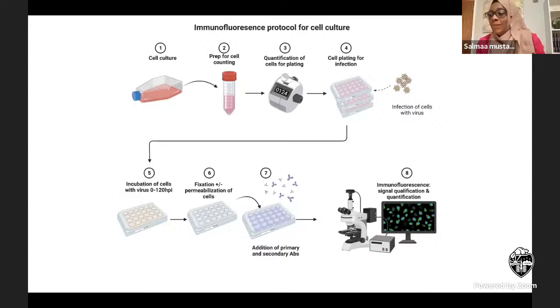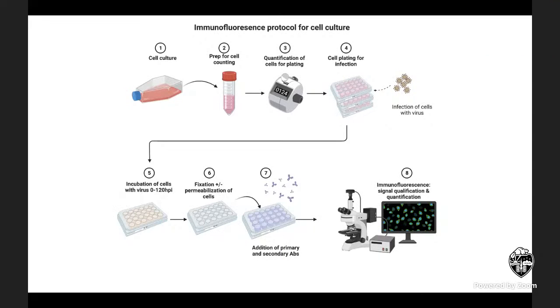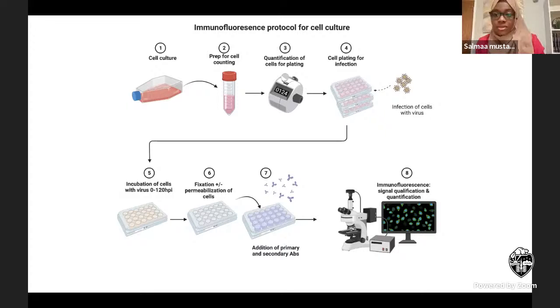So you need to do the same thing, experiments before this experiment. Once you've established your cell replication and growth, you then need to establish your dilution too. Start from the biggest dilution that would almost blind you, and then start from the lowest one where you'd be like, what is this? So it's from, for example, 1 in 100 to 1 in 1,000, or 1 in 1,000 to 1 in 100 concentration. Okay, thank you.